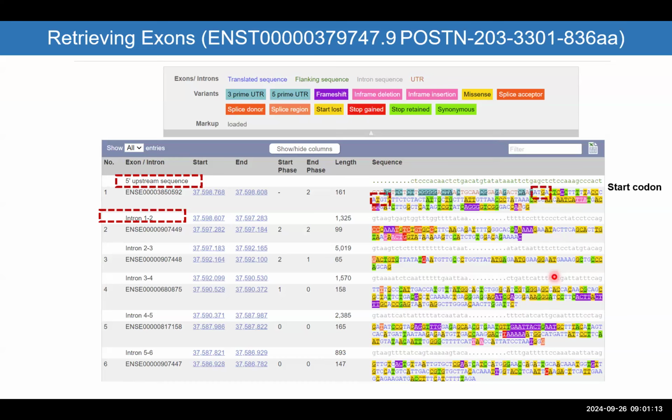Now, if you are on a gene that is being transcribed, obviously in the first exon, you have to be careful that it's the one that is going to give you the start codon. Where is the start codon? Like I located two here. One of them would be that or that. And again, the variability in terms of the proteins of the variants could be because the start codon is different. So it could be this one or it could be that one.